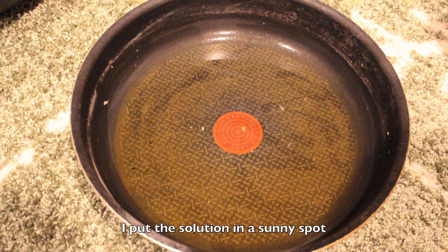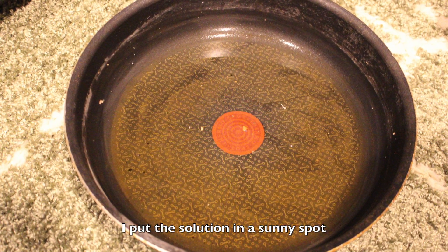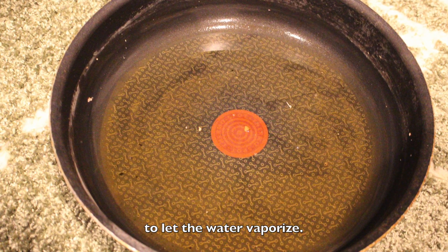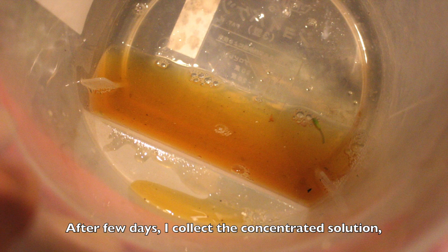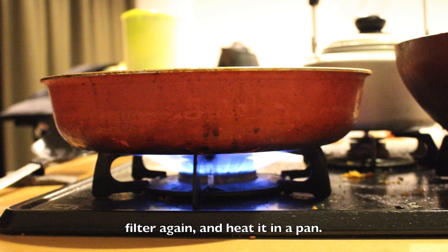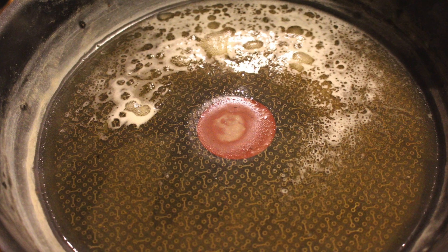I put the solution in a sunny spot to let the water vaporize. After a few days, I collect the concentrated solution, filter again, and heat it in a pan.